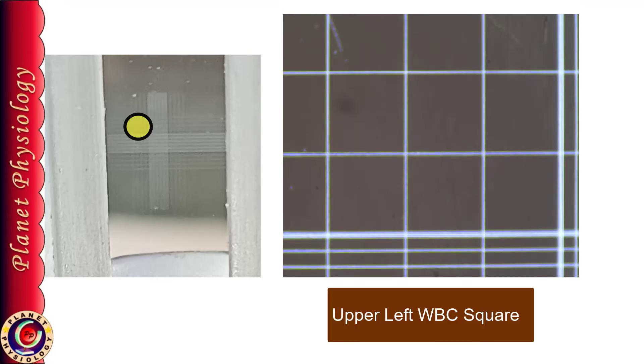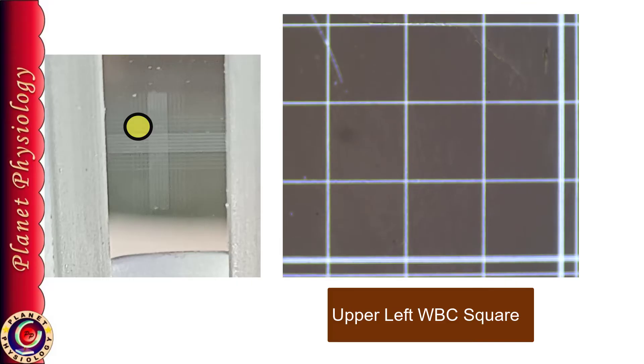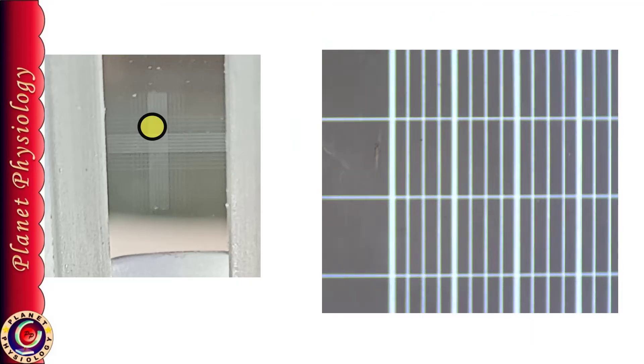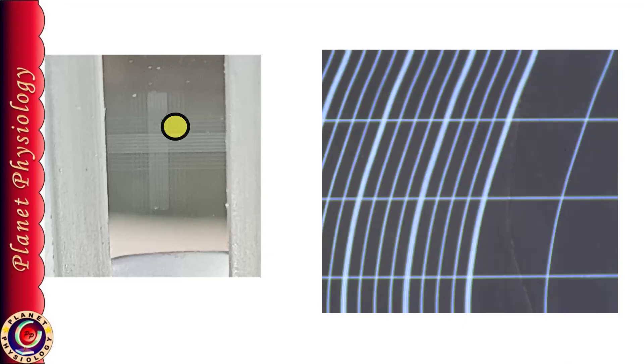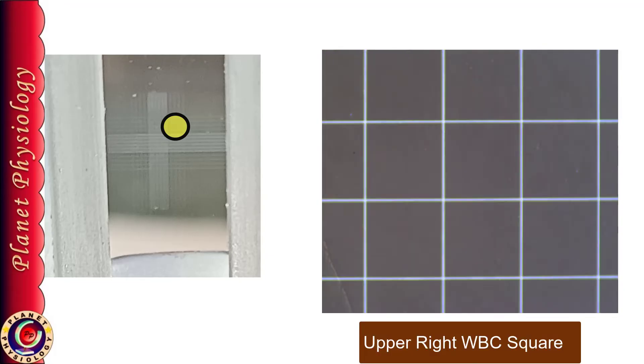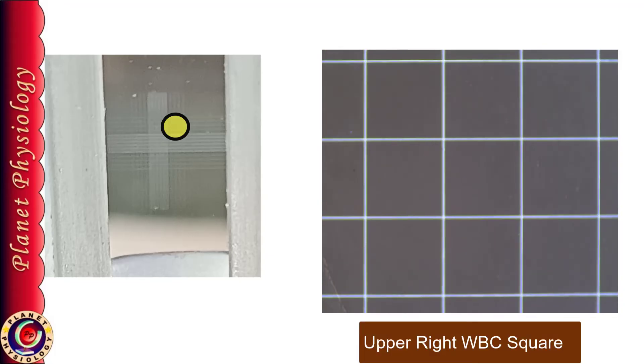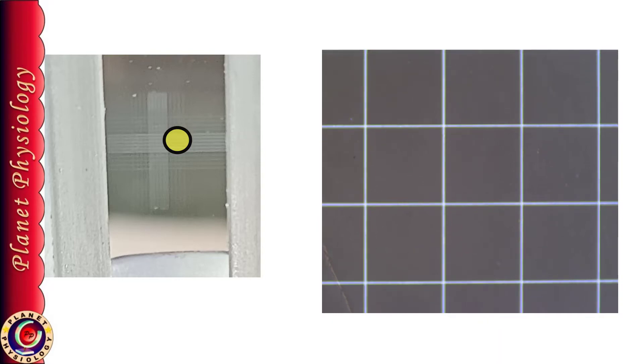From here now I am moving my stage towards the right side till I get a similar square. Now I have reached to the upper right WBC square and move down to get lower right WBC square.